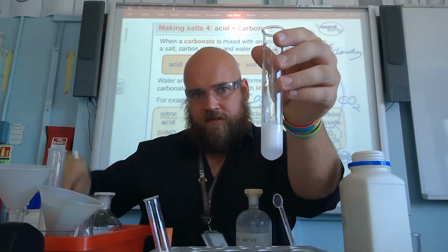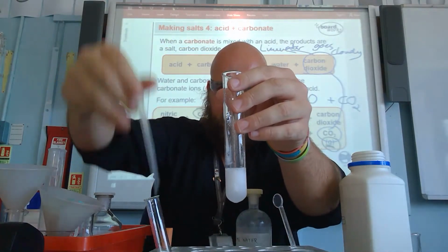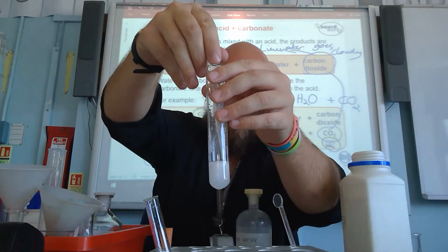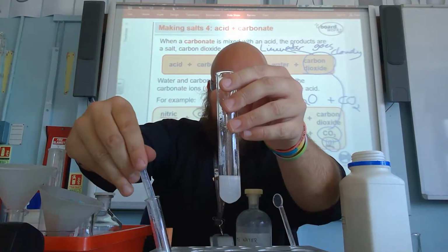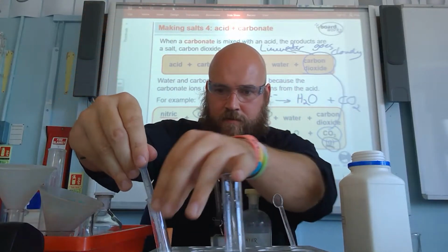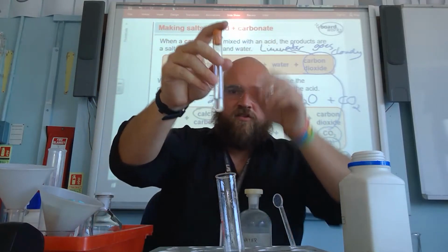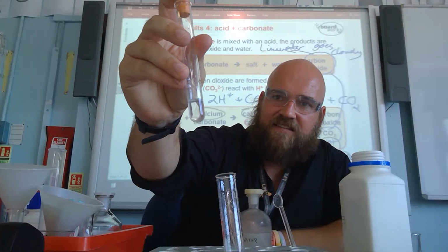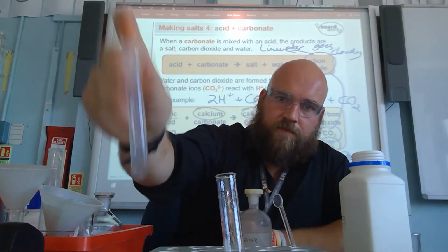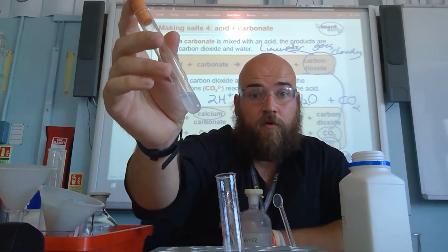Yep. You can see there's fizzing. So I'm going to suck that gas up, put it in there. Suck that gas up, put it in there. Getting as close to the surface as possible, just sucking the gas up, putting it in there, and then I'll put a stopper on it. So now I've got to get the lime water and the gas to mix. So I'm going to shake it. And hey presto, the lime water's gone cloudy.